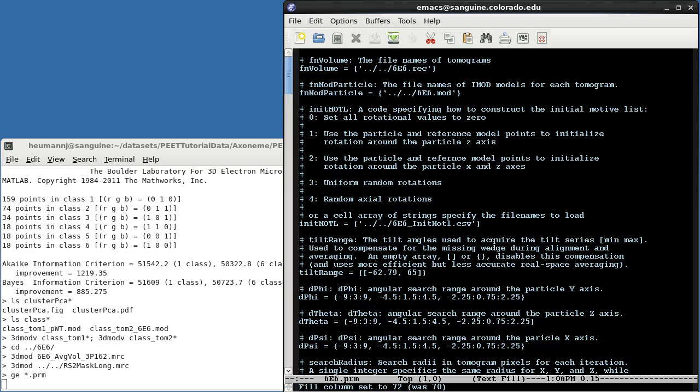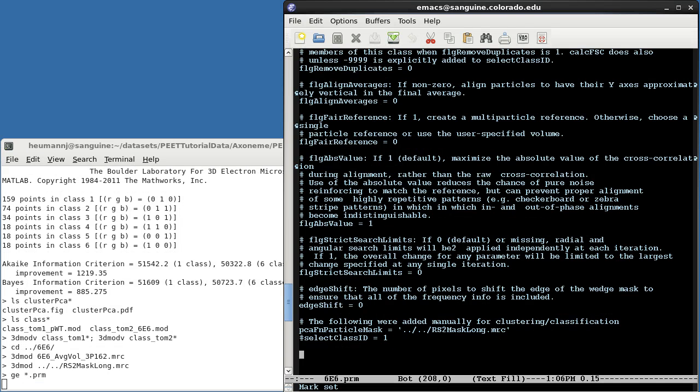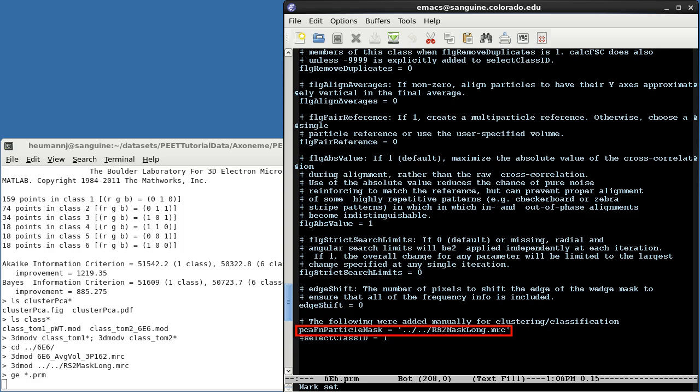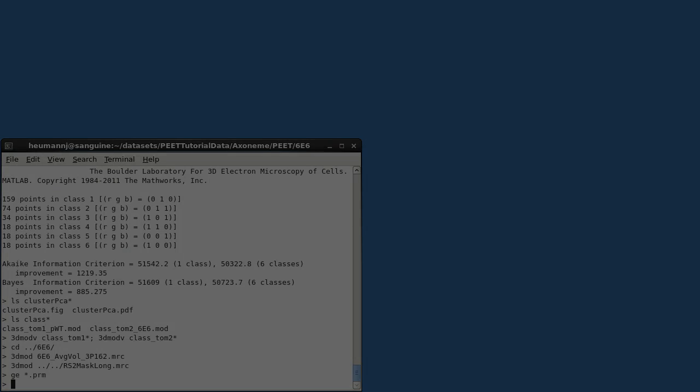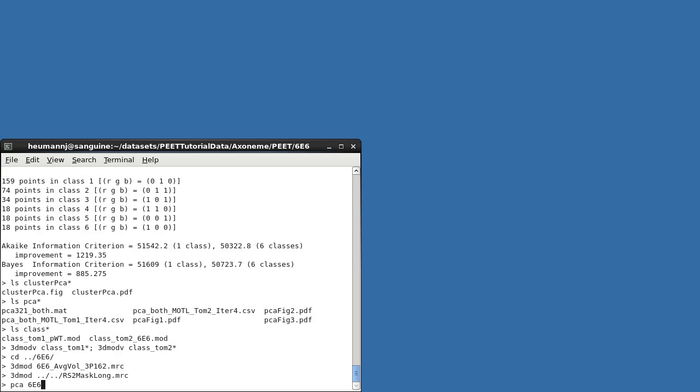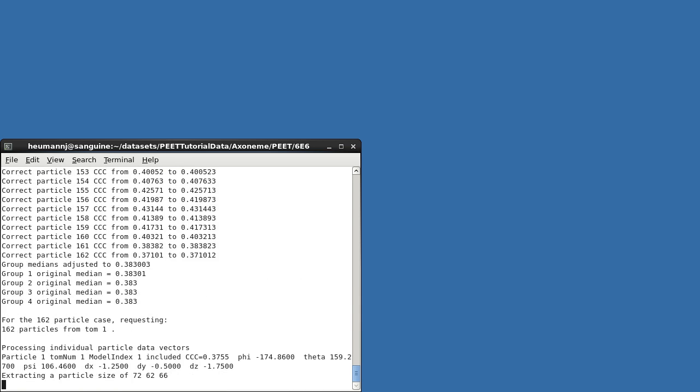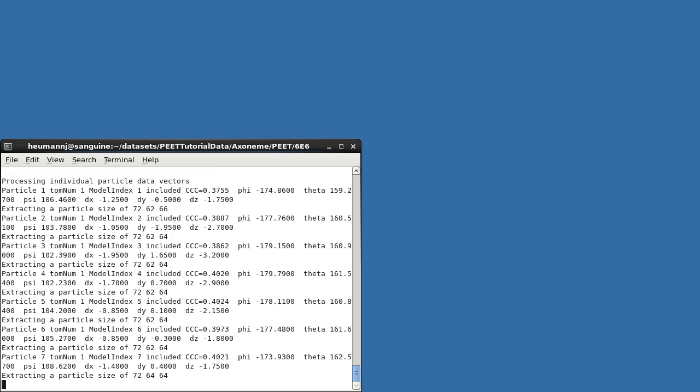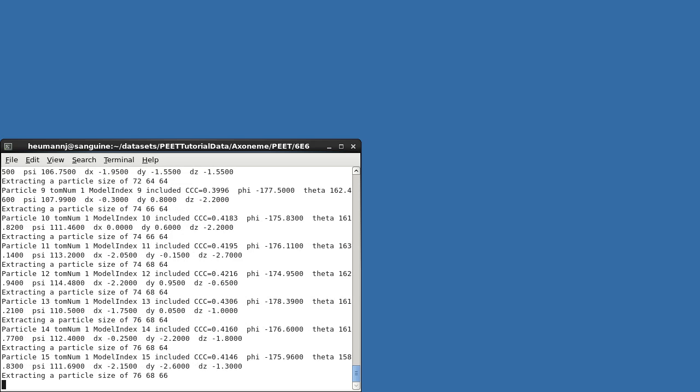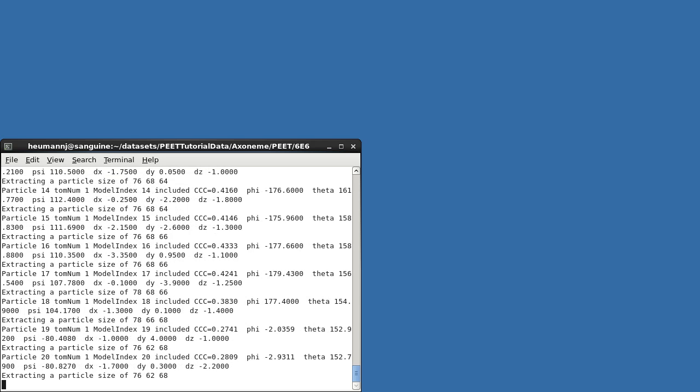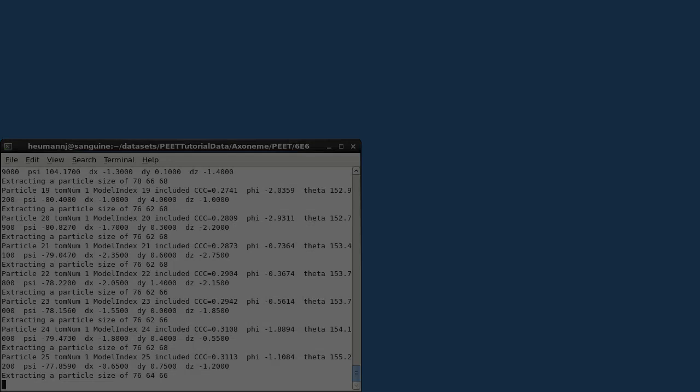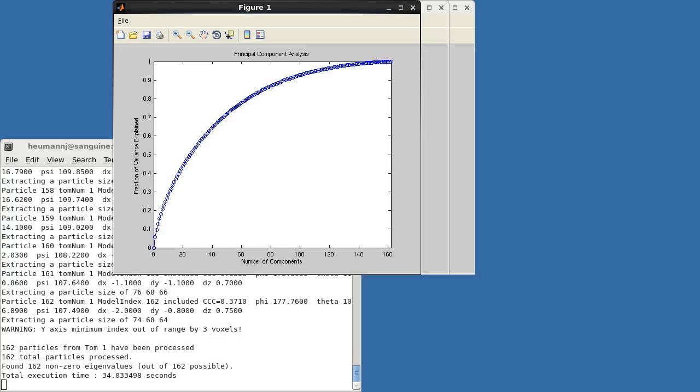To use such a mask file during PCA, you manually add a parameter PCAFNParticleMask to the parameter file. Note that this mask is independent of the mask used during alignment. I'll run PCA on the 6E6 only alignment using this Radial Spoke 2 mask. In this case, you can see that the first six features account for more than 20% of the variance, and also that several of them are somewhat structured, so we'll try using features 1 through 6 for classification.